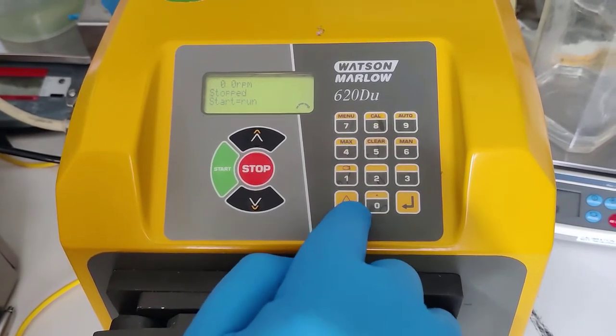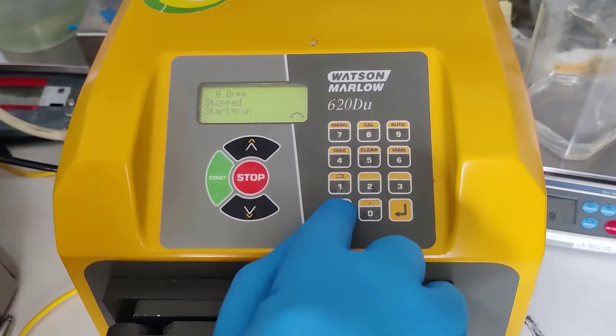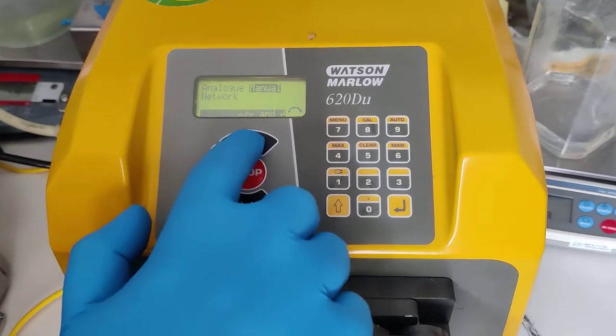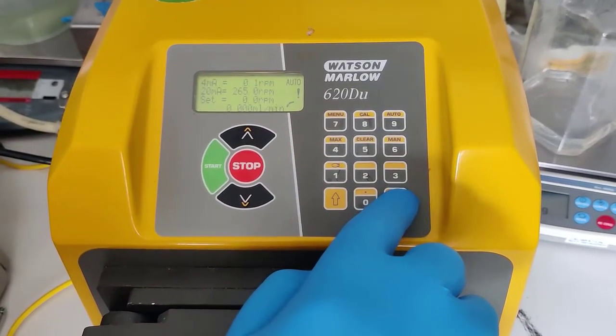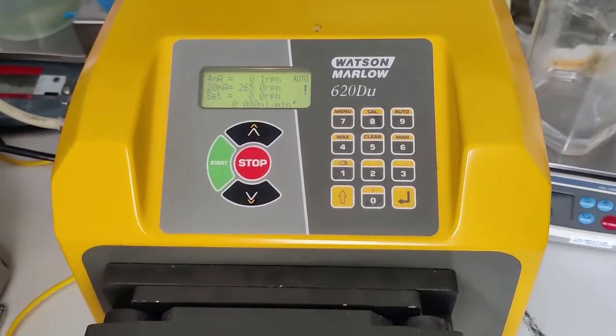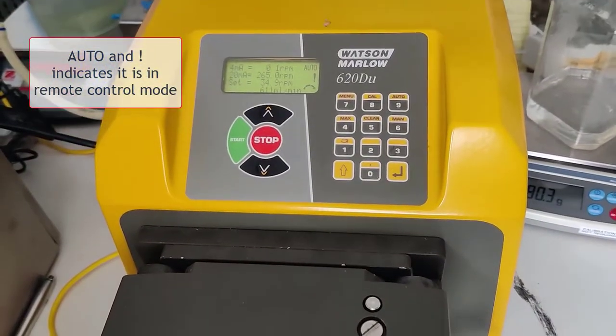To switch to remote control, press the shift key and auto on this model. Then you must go to analog, enter versus network, and it's now in remote control. The pump presses run — the pump runs and it shows the speed.